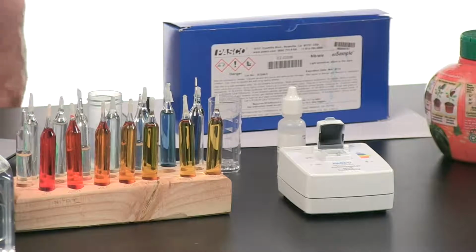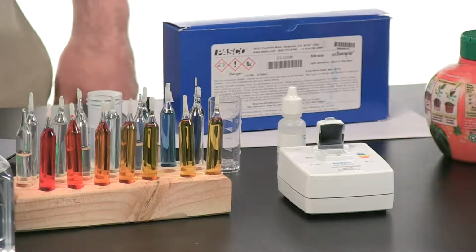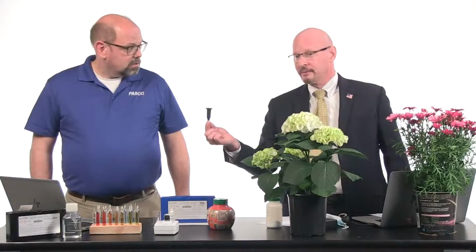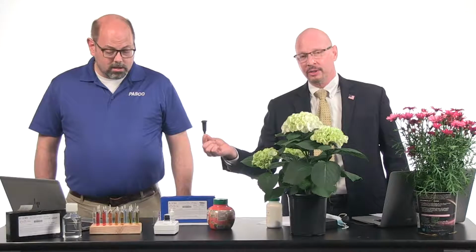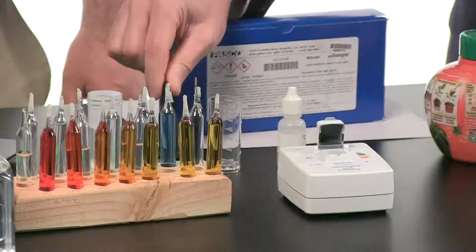This is a colorimeter that can be used for a lot of things in the chemistry lab. That's correct. In the biology lab. Yeah. But it can also be used, I think, with one little addition. Your regular colorimeter that can be used for Beer's Law for concentrations of solutions can become a water quality colorimeter with the use of these nice little Snap Vials.